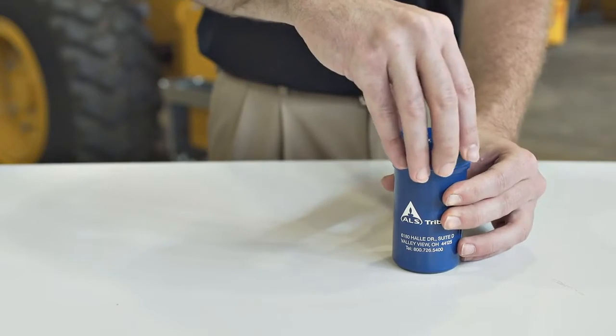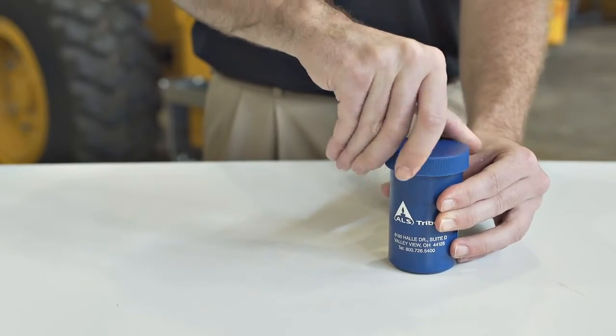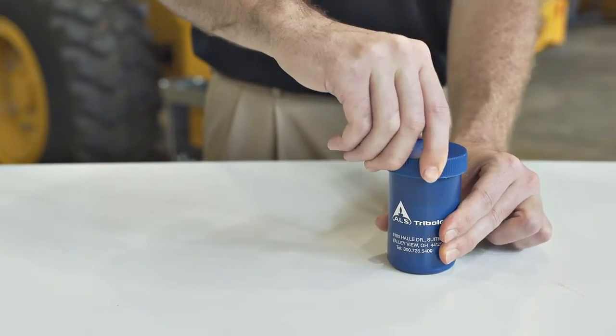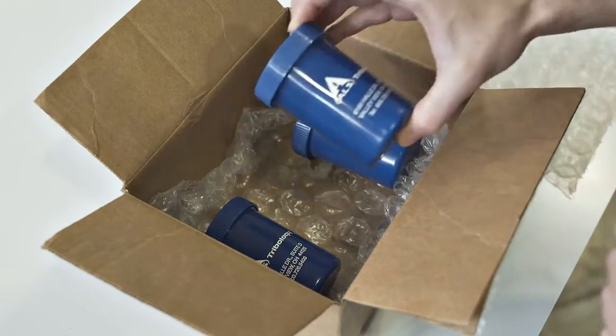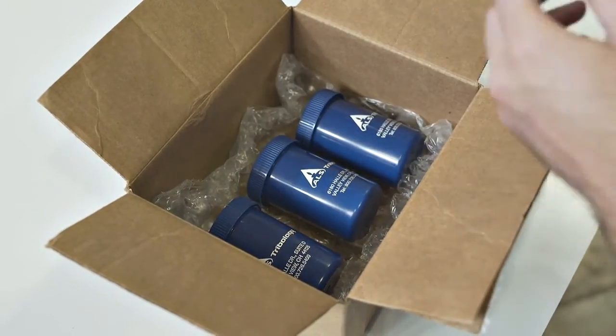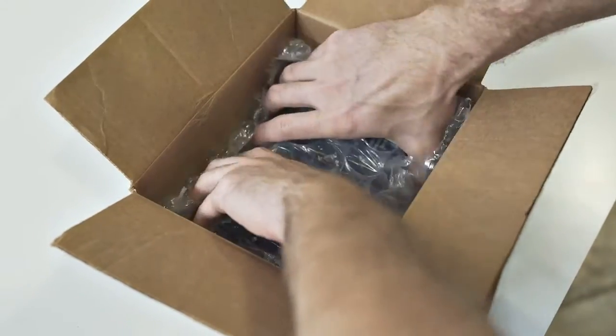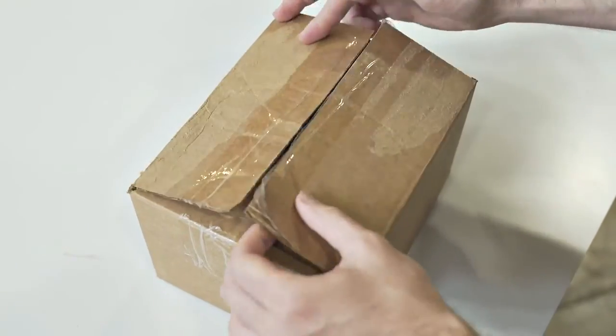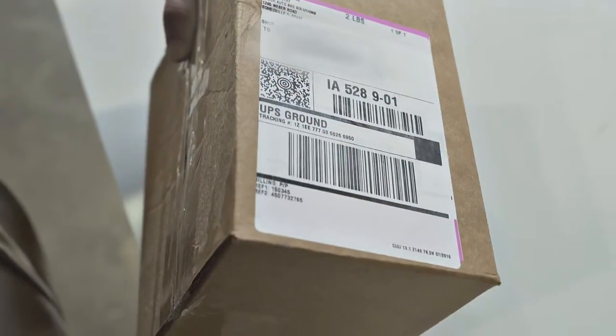Ensure the sample is tightly sealed and there is enough sample to do all testing, but do not overfill the sample bottle. Samples should be sent to the testing laboratory as soon as possible using a reliable delivery method. Establish procedures for reliably sending samples to the testing laboratory.